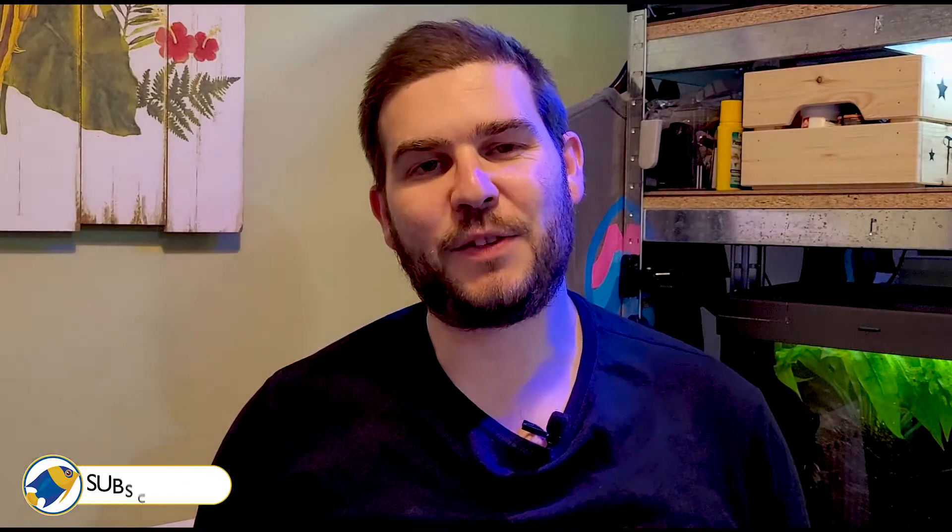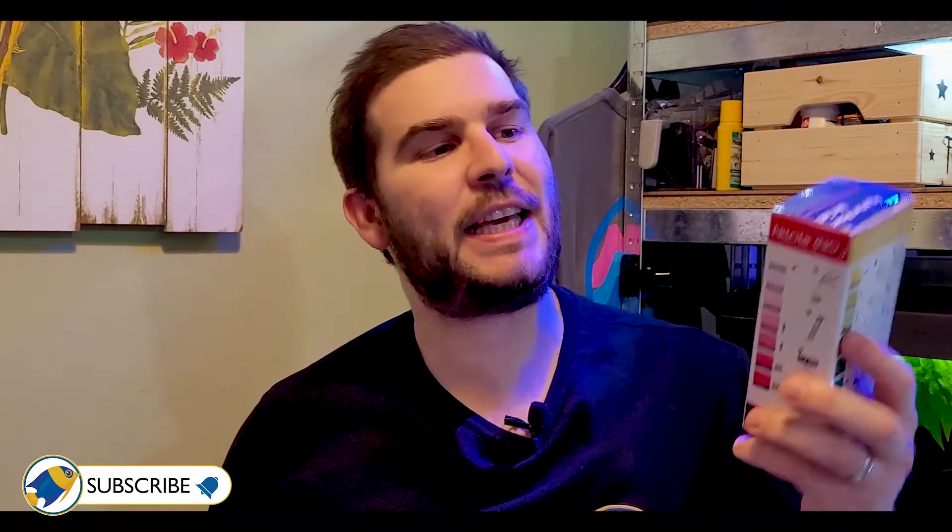What's up everyone, James here. In today's video we're going to be taking a look at the aquarium water mini test kit by NT Labs. I was kind of gifted this product by NT Labs to try out. I actually did want the full test kit that they do, but unfortunately due to the pandemic, supply of test kits is in high demand at the moment, so they only had this one to offer. I might pick one up on Amazon or in the shop at a later date.